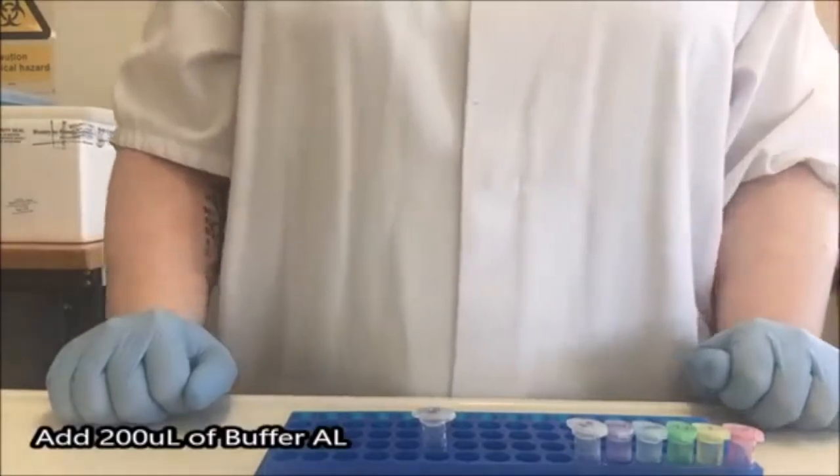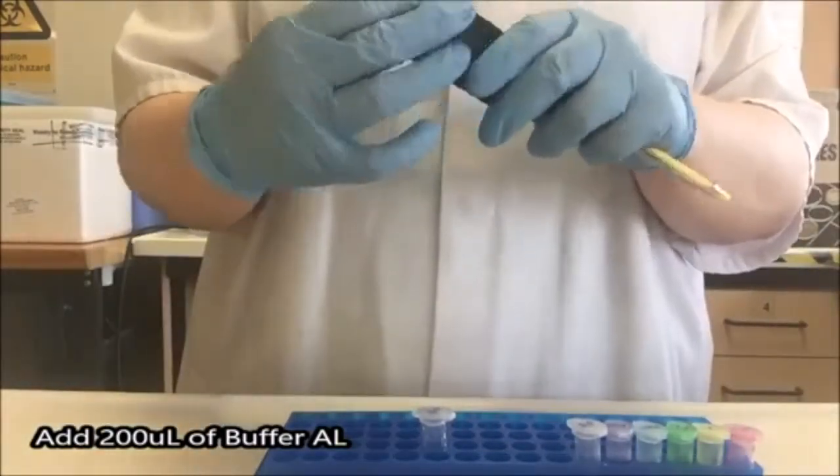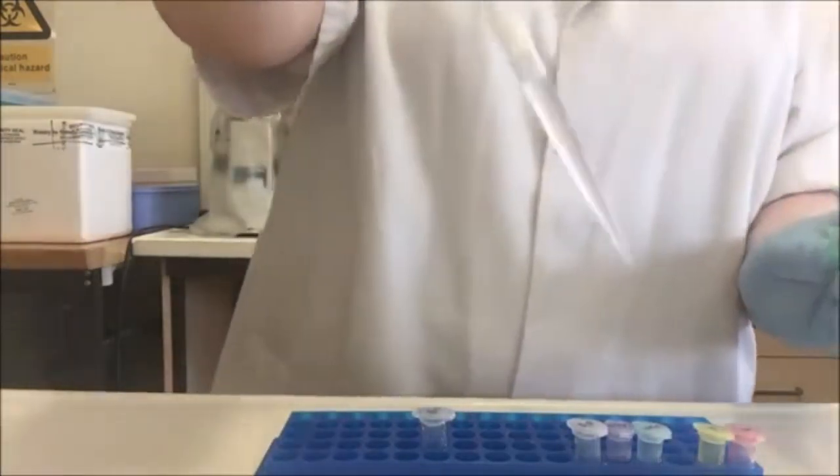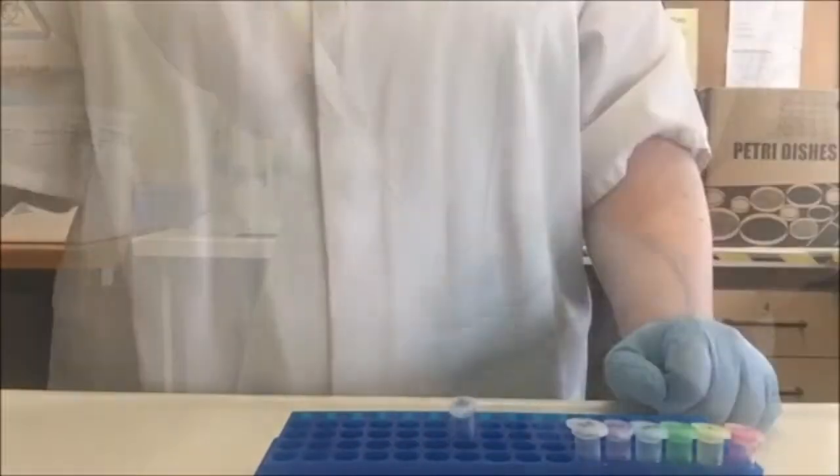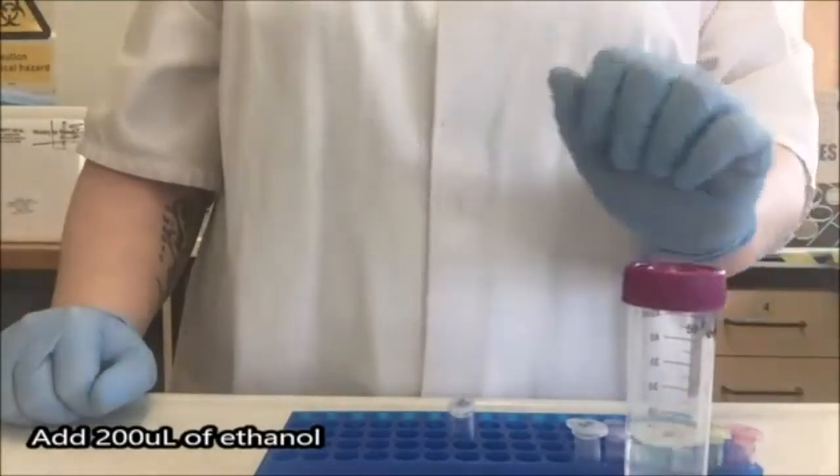My next step is to add buffer AL. We want 200 microliters of that so I'm going to set my pipette to 200. You can see no bubbles, the liquid is not touching the filter. I'm going to add 200 microliters of ethanol, which I have in this slightly larger tube.